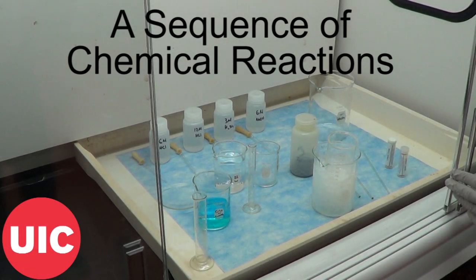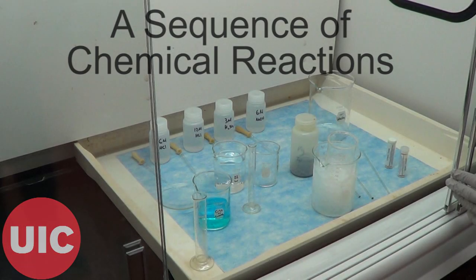In this lab, we are going to study a sequence of chemical reactions. The reactions will be carried out in a 250 ml beaker.